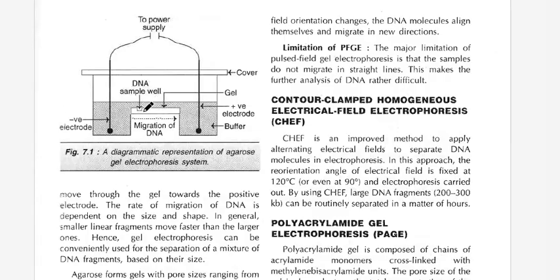As you can see here, these are the wells where the DNA will be put. This is the cover, this is the power supply. Here is the negative electrode and the positive electrode. This is the gel, where the wells are. Into the wells, the DNA samples are loaded.